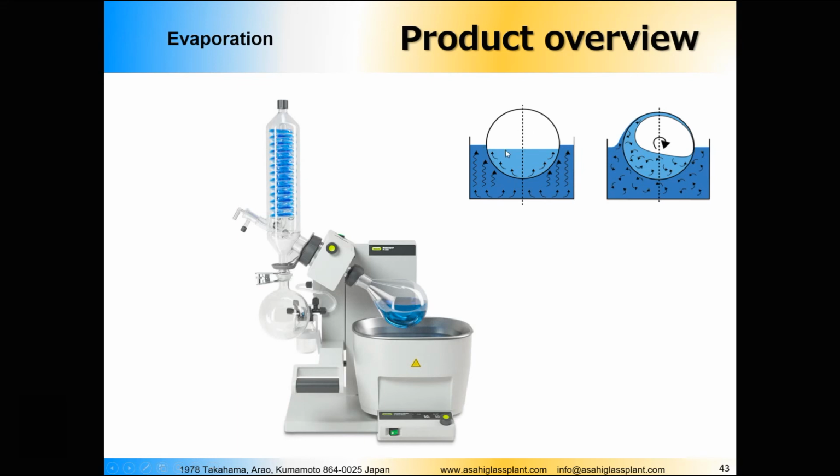When we're talking about standard evaporation, let's imagine this is the water bath and the flask, and the evaporation surface is here. The evaporation speed depends on the evaporation surface. The higher the surface is, the quicker evaporation occurs. When we have a stationary flask without rotation, the surface is only as big as this one.